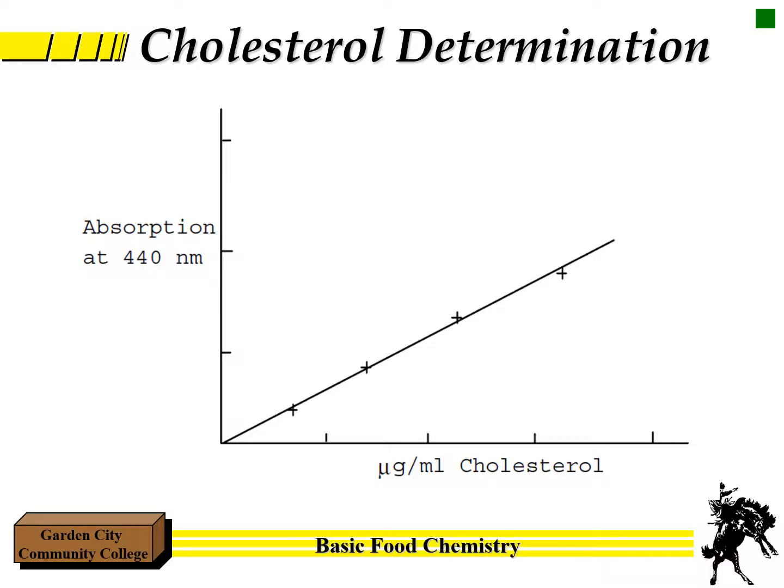So again, they're going to plot those numbers, what absorption rate they got, and then again over time you can actually plot what is the micrograms per milliliter of cholesterol that is in a product.